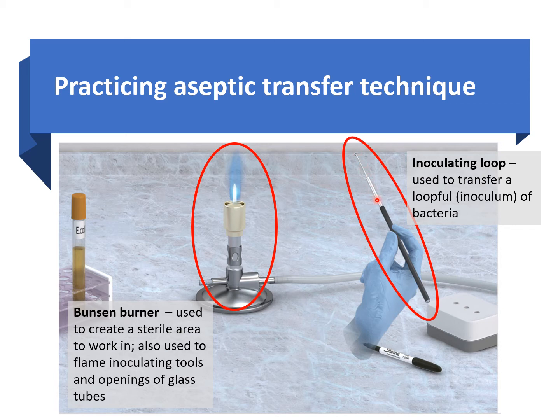So you pass the whole entire metal part of your inoculating loop into the flame, as I said, until it turns red, okay? Once it turns red, don't use it right away. Otherwise, you're going to kill your bacteria, because right now it's going to be very hot. So, just to make sure, after you sterilize your loop, just wait a few seconds before you go ahead and grab a sample of that bacteria, okay?